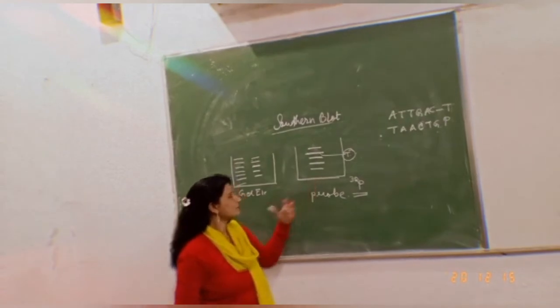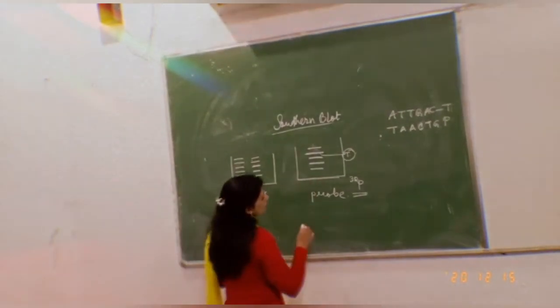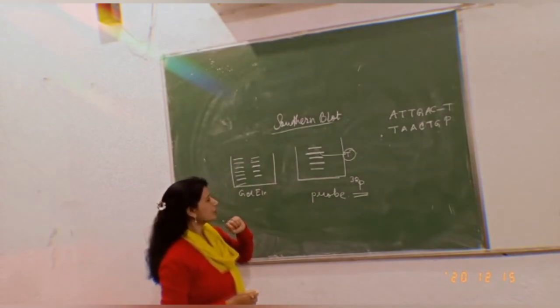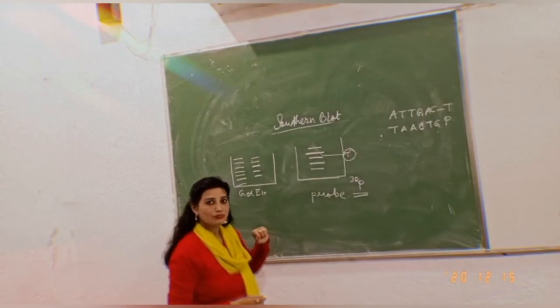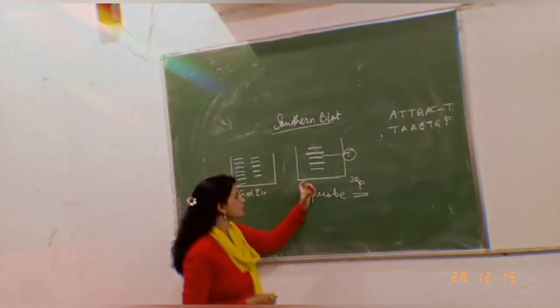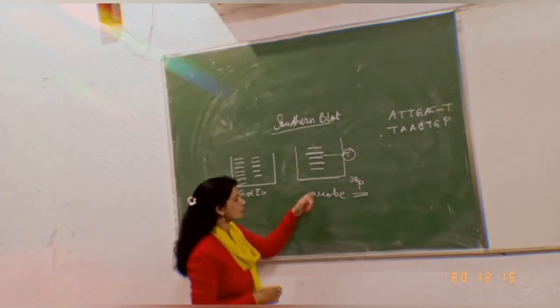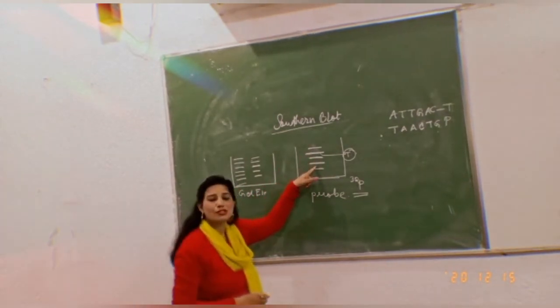But the problem is, right now I'm still facing one problem, nucleic acid hybridization. I must exactly get this position also. And how to achieve this target right now? I have to use my probe. The probe is single stranded. Here the DNA that I have got is double stranded.